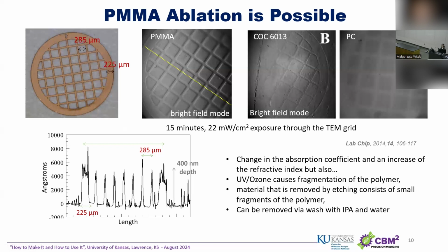For microfluidics, that may be absolutely of no consequence to you, okay? But when we're working with nanofluidic devices, that could be absolutely essential to know that this process is taking place. Because if, as Sanguk was talking yesterday, you're producing 20 nanometer structures, ablating as deep as 400 will basically erase your fabrications, right? So those are things that you need to consider.